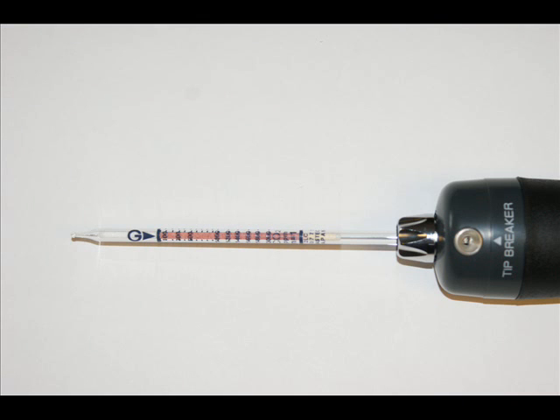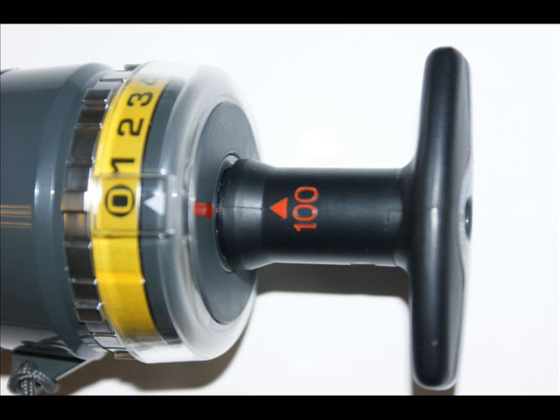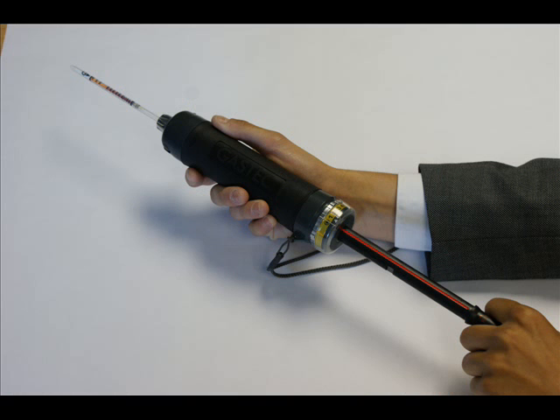Start by placing an unopened tube into the rubber seal at the end of the pump. Line up the 100 marker to the marker at the base of the pump. Then pull until you hear an audible click.